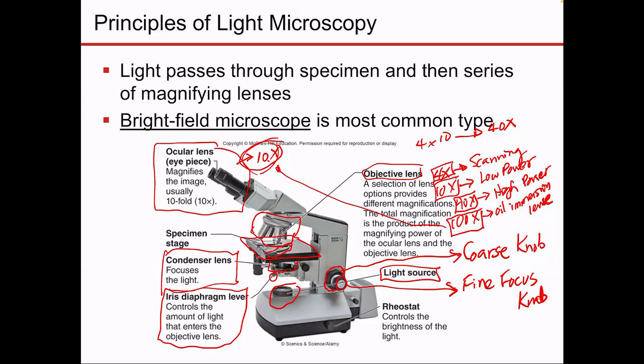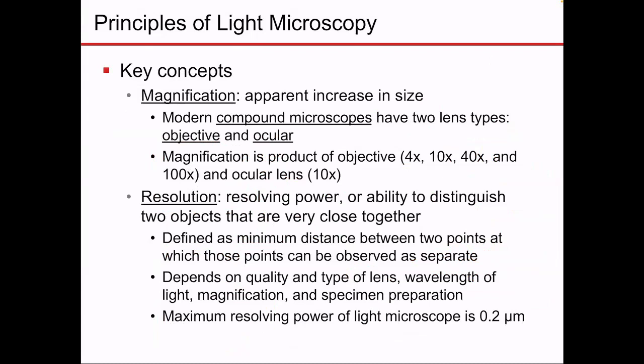Okay. Let's now go through some key concepts related to microscopy, and we are starting here with magnification that we just talked about.